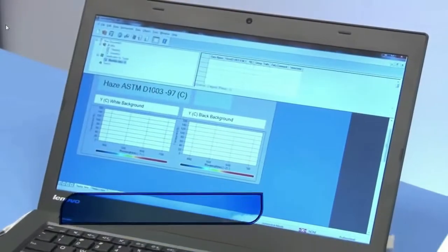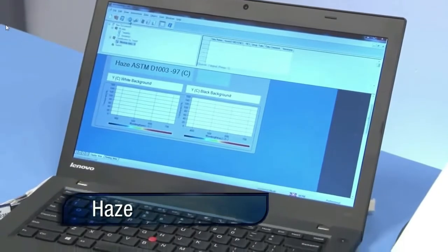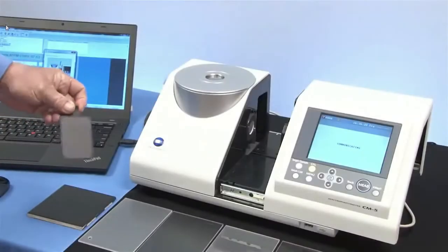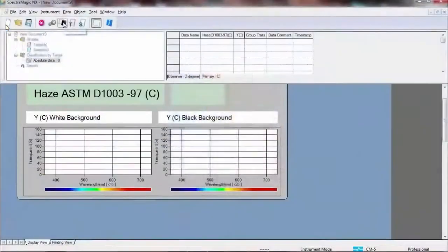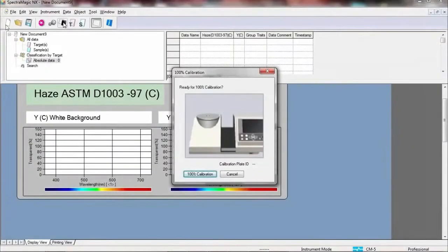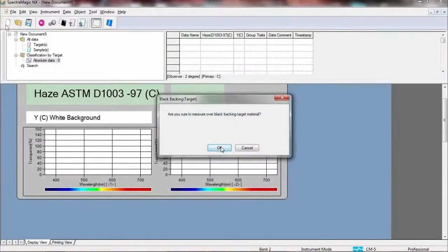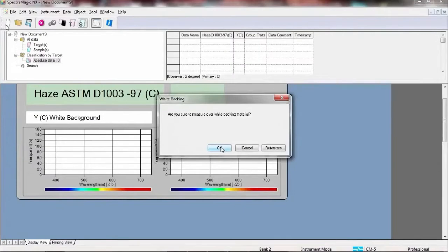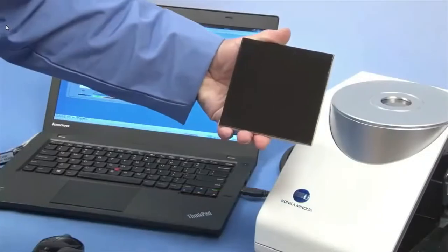For haze measurements, the CM5 is driven by user-friendly Konica Minolta Sensing SpectraMagic NX software. This procedure requires a measurement over a contrasting background. When creating a target, you will be prompted to take two measurements for each reading, one over white and the other over black. The reflectance port must be blocked.